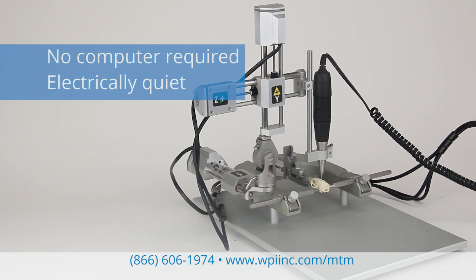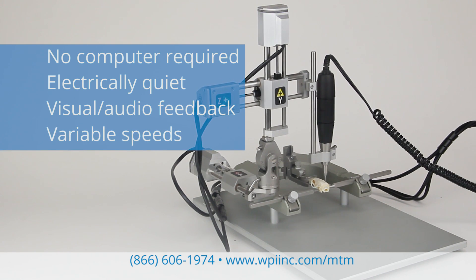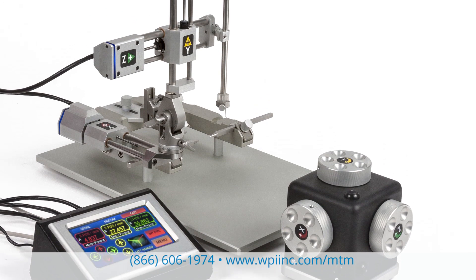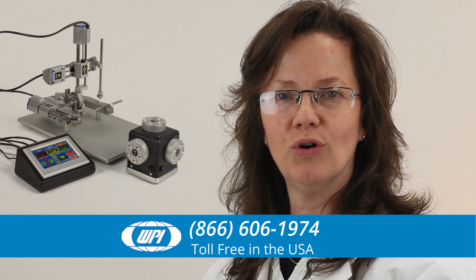The MTM3 is electrically quiet. It has visual and audio indicators with each axis and variable speeds. The MTM arm may be added to your existing frame. The MTM3 simplifies your surgical needs — you can count on it for precise, repeatable movements time after time. For manual or programmed movements, the MTM3 puts the ultimate control in your hands.